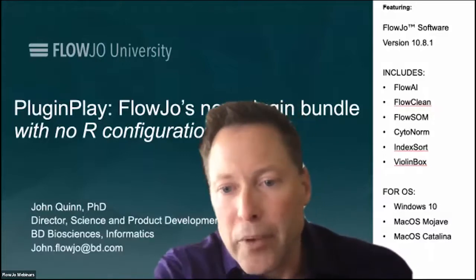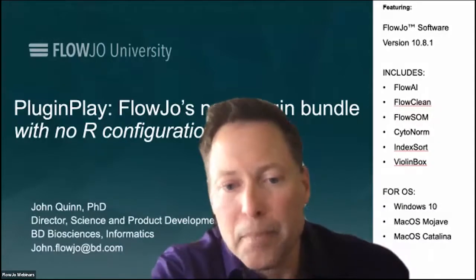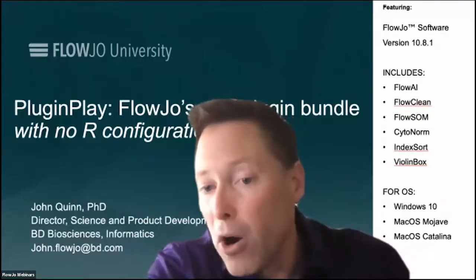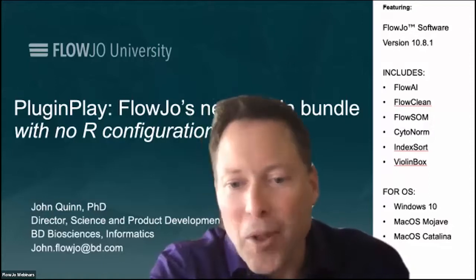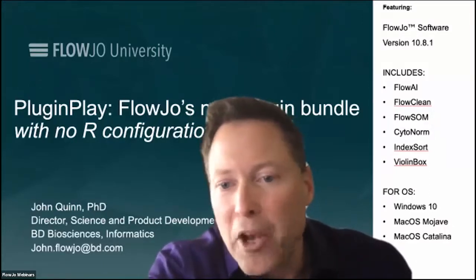it easier. For a lot of folks, the real difficulty with plugins has been maybe permissions, or just some of the setup with getting anything that an outside researcher wrote in R to be able to enable in FlowJo. A lot of that is just because the version of R, the version of the plugin, and the version of FlowJo all have to match and so forth. So let's see if we can help you out with that.